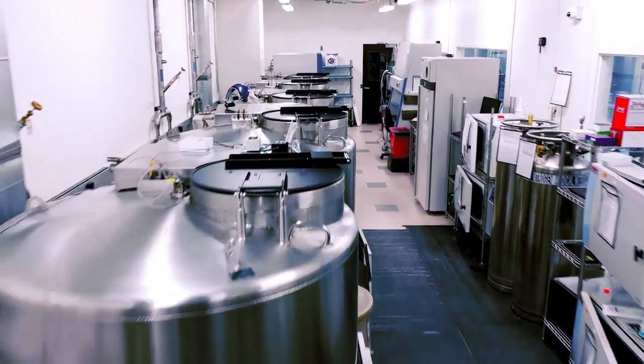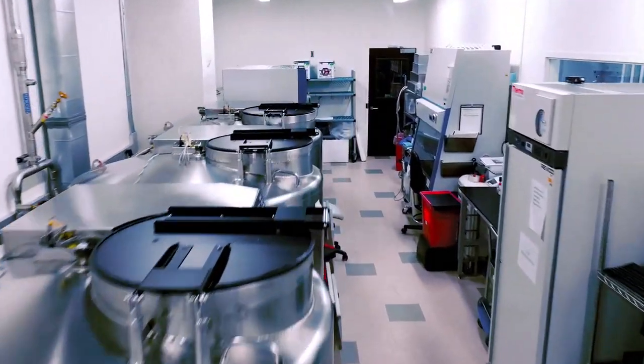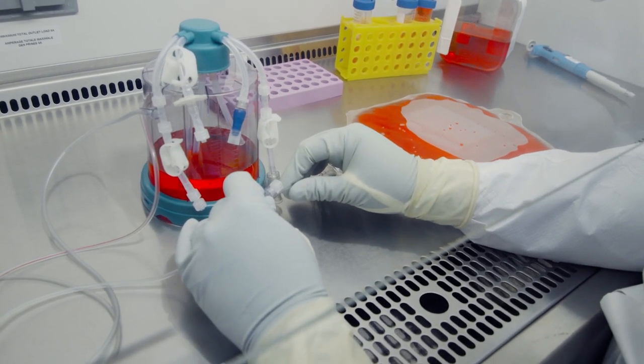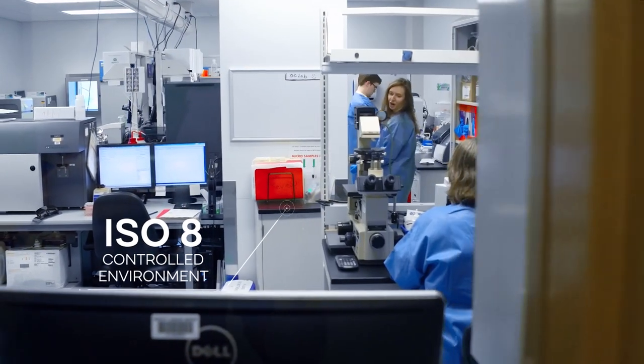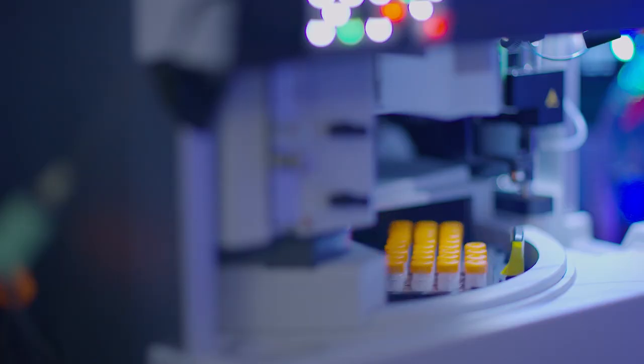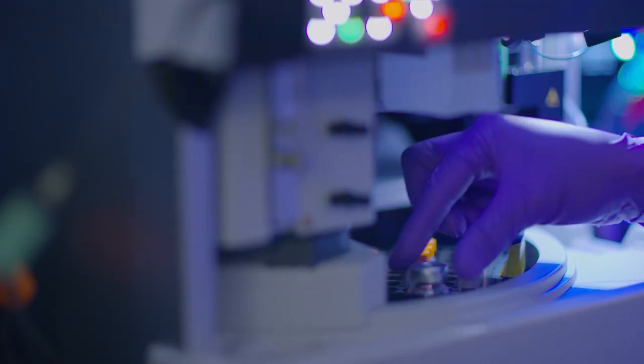The facility was designed for development of IND-enabling technologies that are crucial to accelerate the discovery of new drugs and includes a new ISO-8 GTP laboratory, allowing for state-of-the-art development and automated closed-system manufacturing.